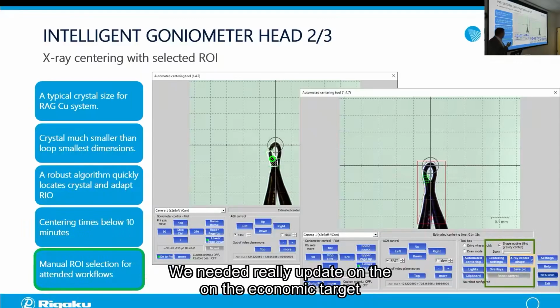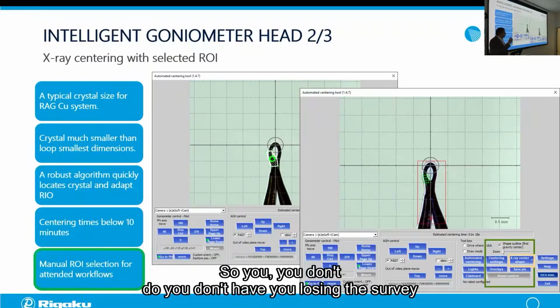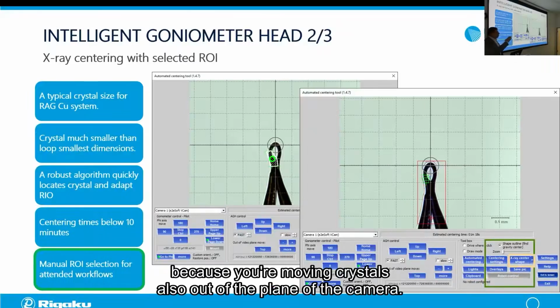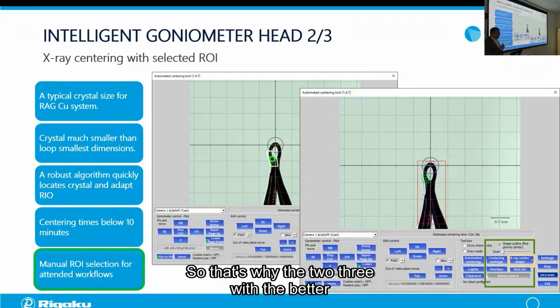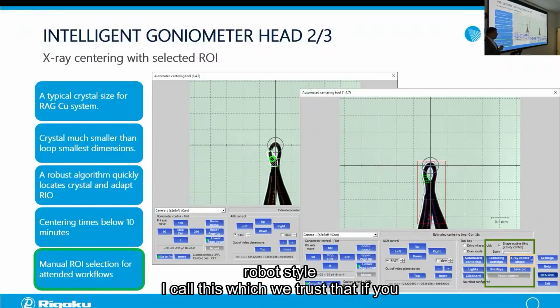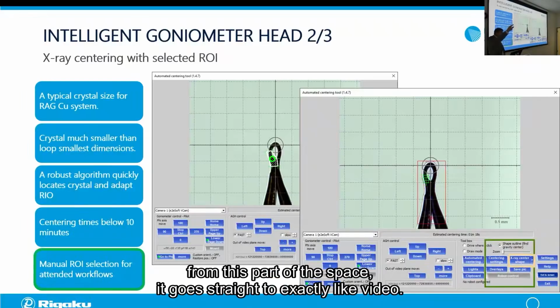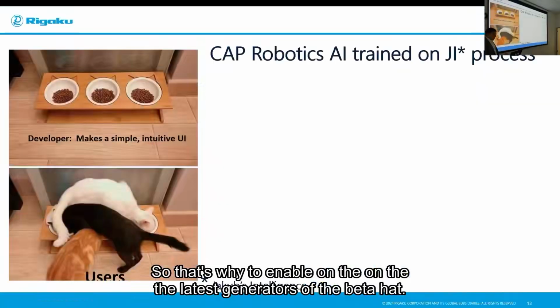We really needed an update on the goniometer head, because you're moving the crystals in 3D space, so you lose the ability to check with the camera as feedback for your movement, because you're moving crystals also out of the plane of the camera. So you have to really trust your goniometer head. That's why the IGH2, IGH3 with the better robot-style encoders, which we trust that if you go there and start scanning from this part of the space, it goes straight to exactly where we want. So that's why it's enabled only on the latest generations of the goniometer head.